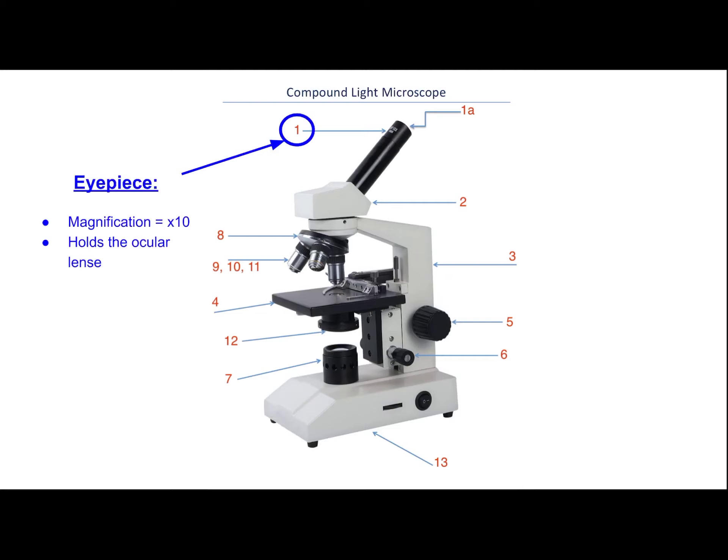The eyepiece is the one that's going to be closest to your eye. The piece of glass in there is called the ocular lens. The ocular lens has a magnification of 10 times — you can see the number on the actual lens itself. Every microscope should have a number printed there for how much that single piece of glass will magnify the image.